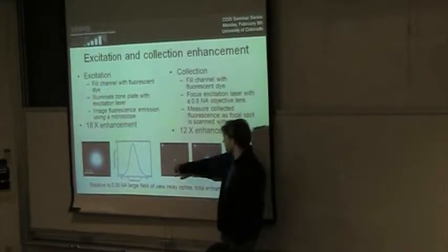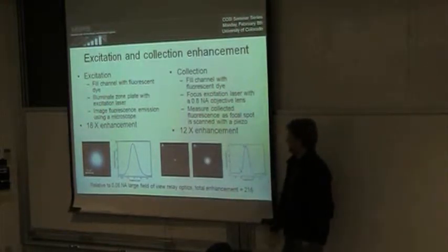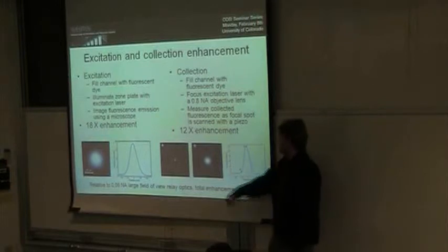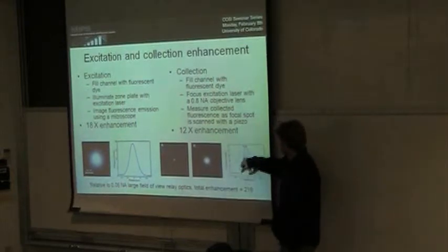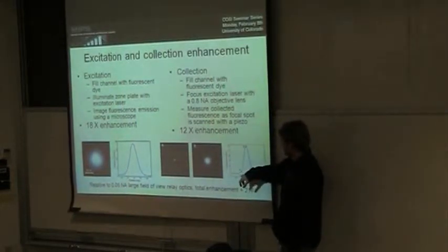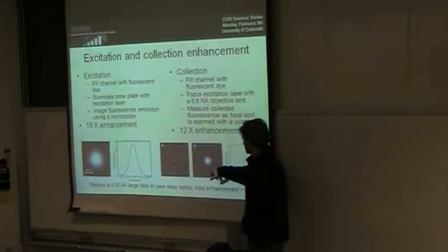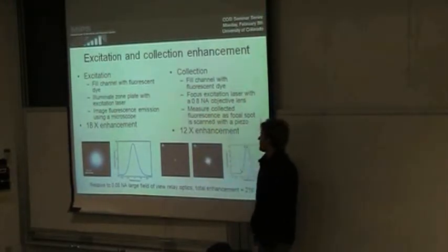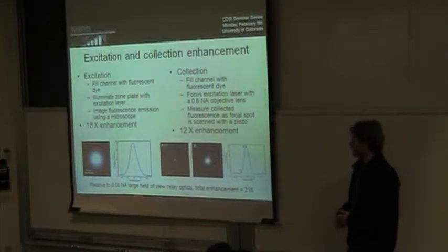And what we find out is the zone plate only efficiently collects the light when it's overlapped with the optical axis. So when the point source is overlapped with the optical axis of the zone plate, we get a curve like this experimental curve also, and we can see that when it's right on the optical axis, the whole zone plate lights up. And so there's two different ways of looking at it. It's similar to a confocal filter.